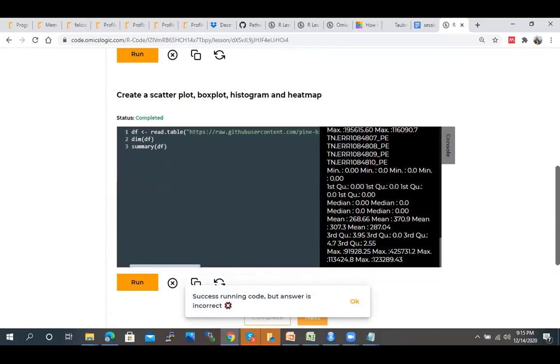If you look at this now, here you will find details like the minimum value, the maximum value, the first quartile, and the third quartile. If you look at this data, the minimum value is 0 and the maximum value is something like 91998. Now, next, how we can perform the log scale transformation.